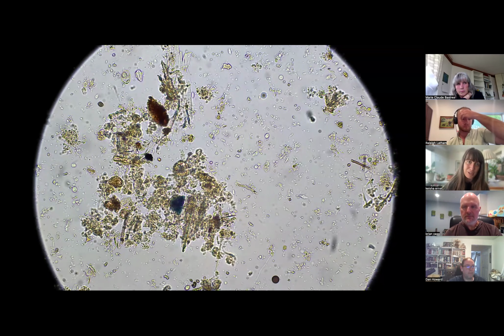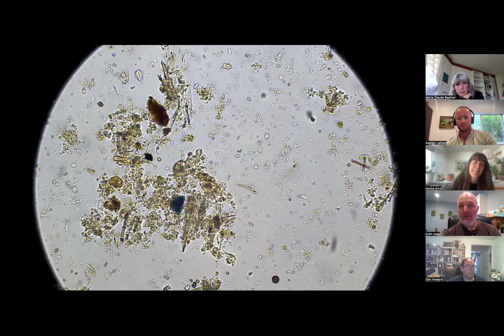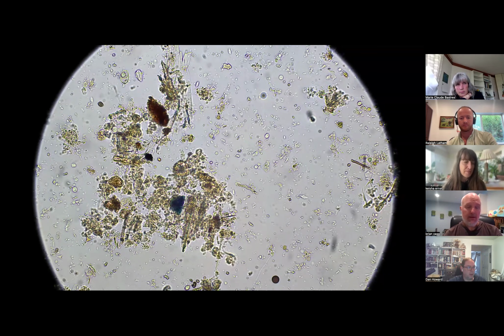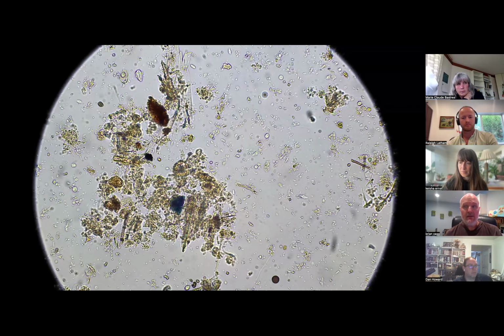It's in a spreadsheet, which means Brian's the one that put together all of the back end of the inner workings. So do you want to talk about that, Brian? Sure. Like Keisha was mentioning, we're looking at a protocol to do qualitative analysis, and it really is more like a scorecard. We're not measuring. We're not going in and saying we saw a fungal hyphae of this diameter, this length, and using really advanced math or extrapolations to come up with pure quantities. That's a quantitative analysis. Our qualitative analysis is more, did you see fungal hyphae? Did you see fungal spores? Did you see protozoa? Did you see nematodes?